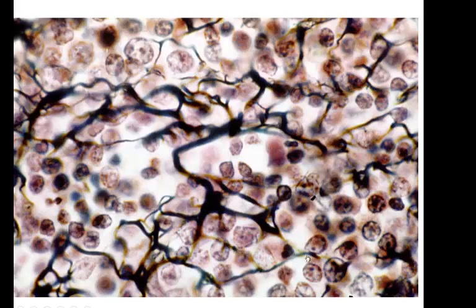That says your identification for this tissue. You don't see elastic fibers, and you don't see collagen fibers. And this is a great slide of reticular tissue. All these other cells in the background, these are lymphocytes, because where we find reticular tissue tends to be in lymphoid organs like your spleen or your lymph nodes or bone marrow.